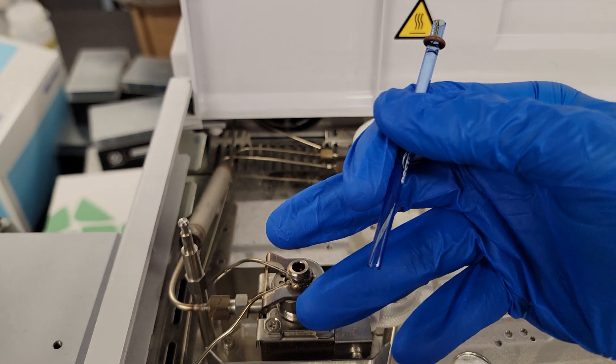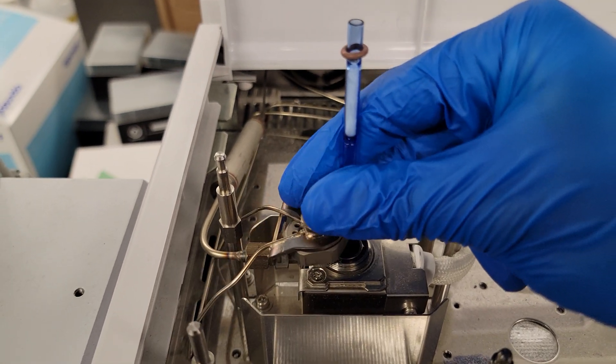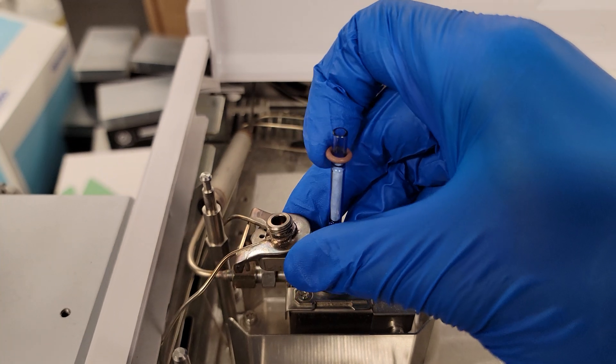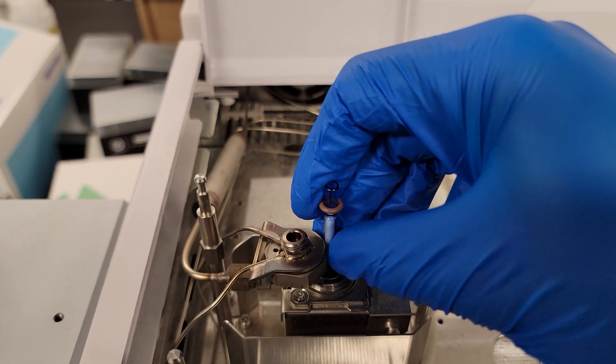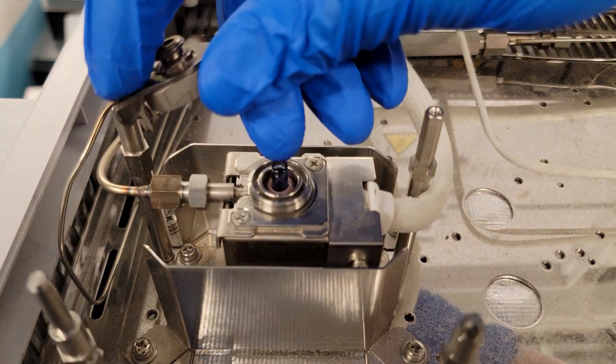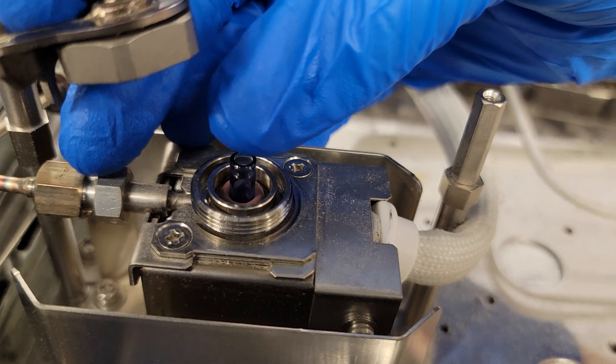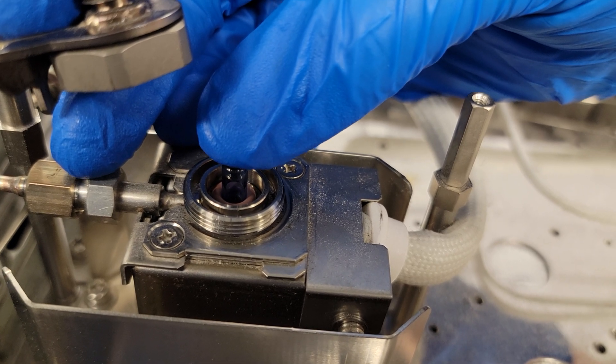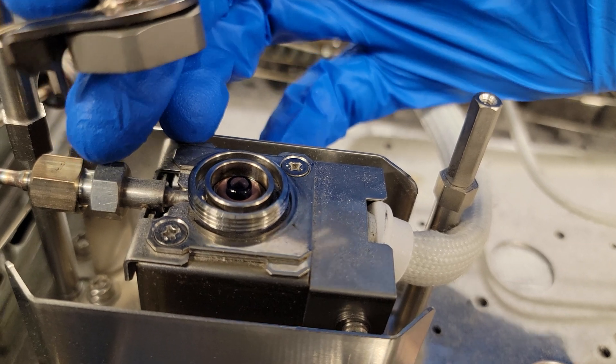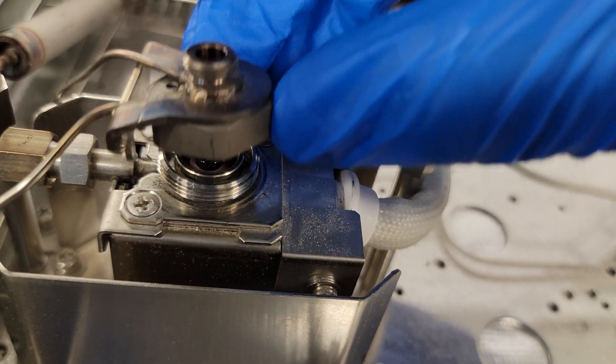I'm wearing brand new clean gloves here - I think that's at least kind of important if you want your samples to turn out okay. I'm going to try to slowly lower it in one-handed. There we go, dropped in. I'm going to push the topaz insert down until it's seated. Just pushed it all the way down and now it's seated. We have the o-ring, we have the insert.